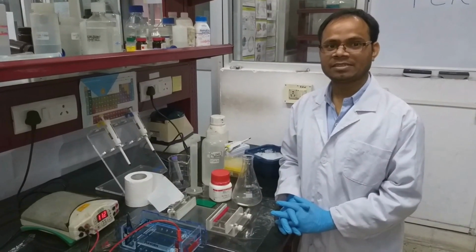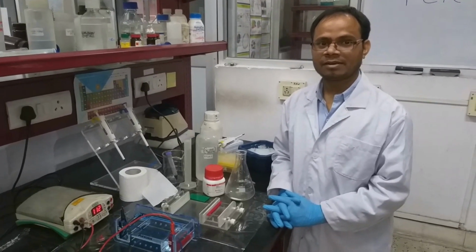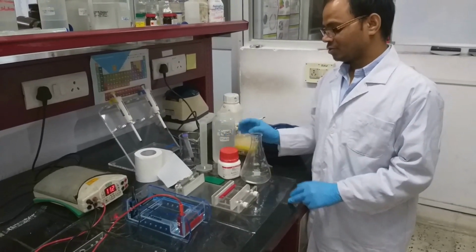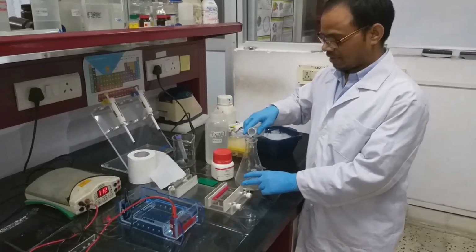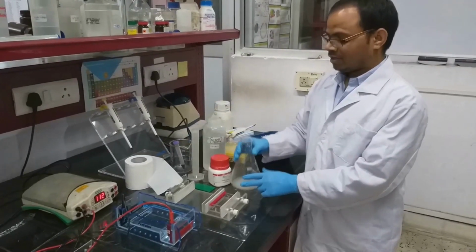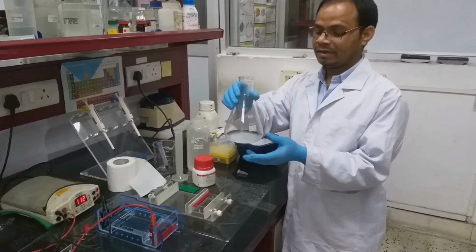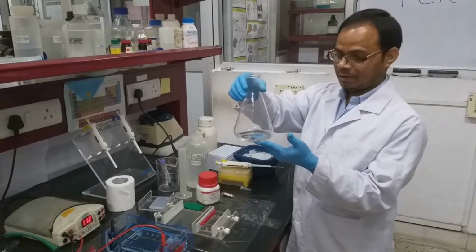Once the PCR reaction is completed, we have to analyze the results for amplification. For that we need agarose and TAE buffer. First we have to weigh agarose and mix with the TAE buffer. It will not dissolve easily, so we have to heat it in a microwave oven until it gets dissolved. Now agarose got dissolved in TAE buffer.